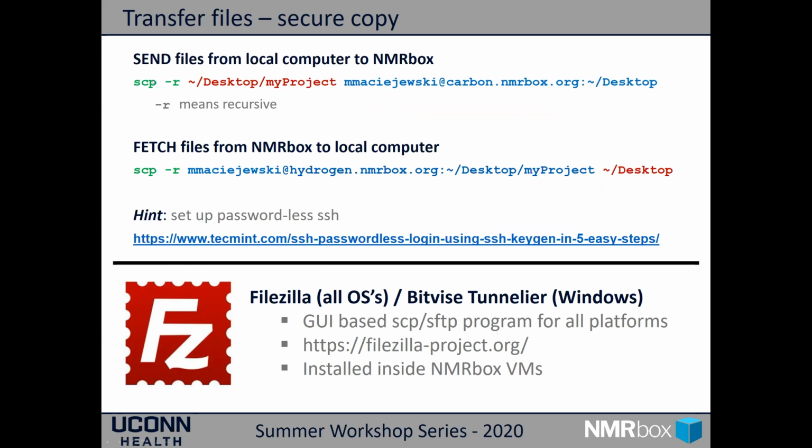We support secure copy, so you can use a command such as this, and I'm not going to go through it. I'll put the documents here for you to go over later on your own, but you can secure copy files to or from NMRbox. Here's a nice website showing you how you can even do it so you're not prompted for your password.